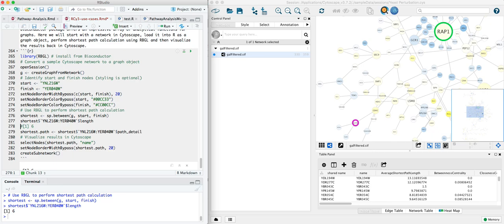We can print out the length of that path if we want. It's now the shortest object. So there's six steps to get from RAP1 to this GLN3.